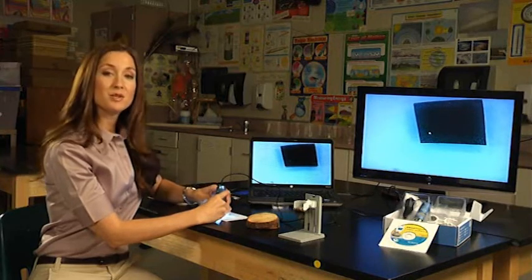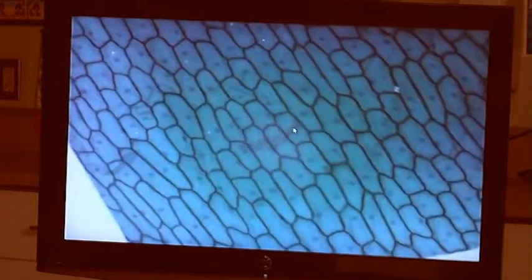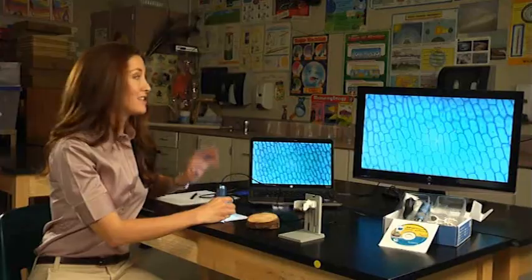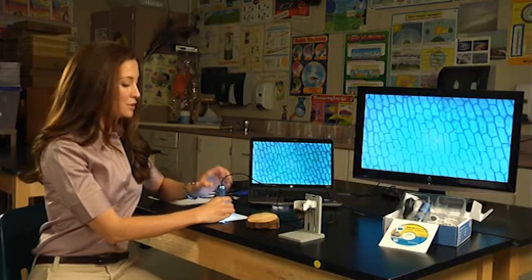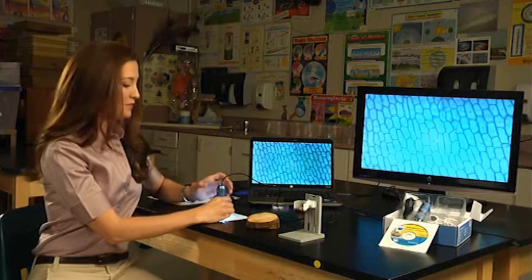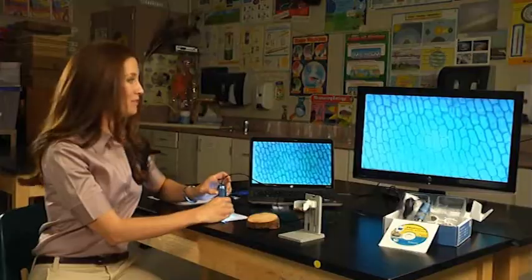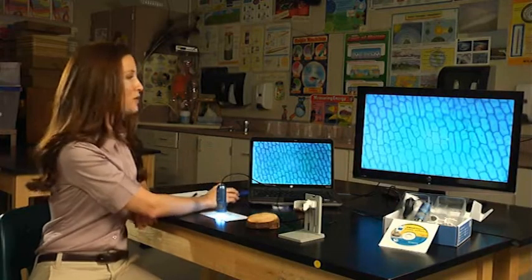And then you can even zoom in more. Continue turning the dial to the left. And you can see the onion skin at 200X magnification. I think this is a great shot. So in order to capture an image, all you have to do is press the button right at the top of the SmartScope 5M. That's the camera. Press that. It's captured the photo.